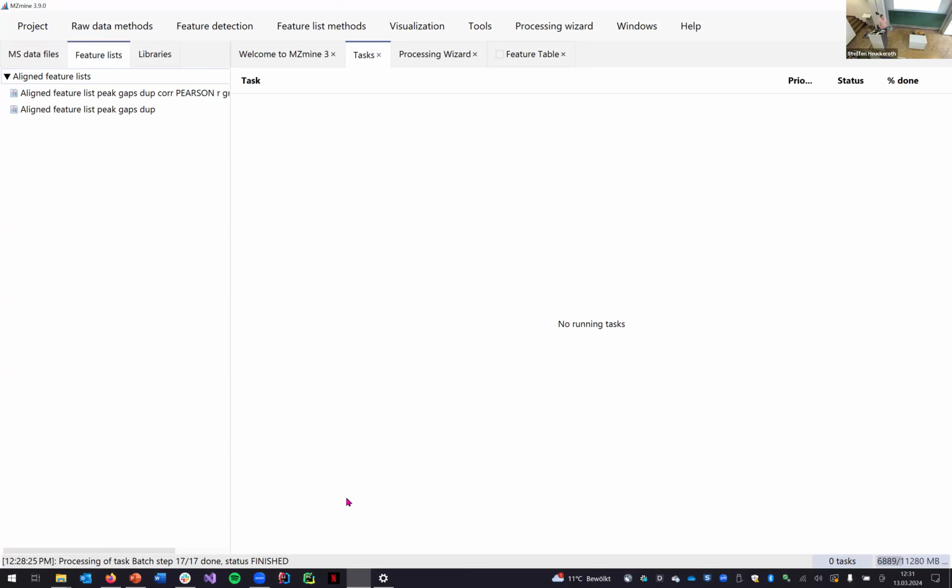Because again, the same happens with other software like XCMS. If you're not aware of that, which I don't know if many people are, you start playing around with your values for the parameters. But then there is a lot of room for errors. Right? So I was wondering if you are aware of, maybe not within MZmine, but maybe an alternative source or software that helps you with this parametrization for MZmine.